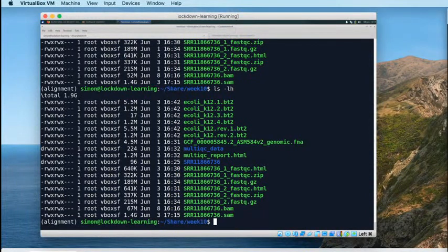I should note at this point also the other file format conversion that samtools can do, which is to convert not to BAM but to CRAM. So CRAM is another related format for sequence alignments. CRAM is a little bit more modern than BAM and potentially is better at compression as well, so you can compress your data more with CRAM.